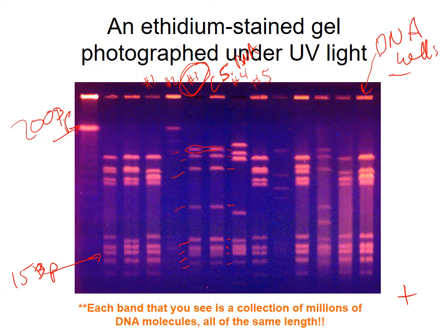So this would lead us to suspect number 3 being the person who was at the crime scene, because these are the DNA evidence that we've collected from the crime scene. This could also be used to help figure out families, whether or not they're related, and things like that. So that gives you just a little idea of what some of these things can be used for.